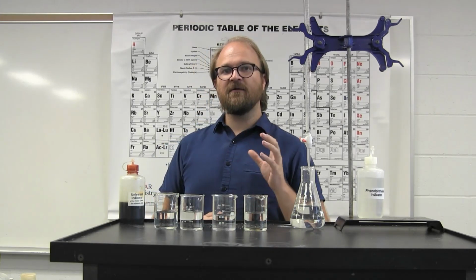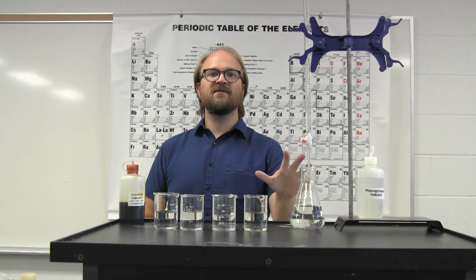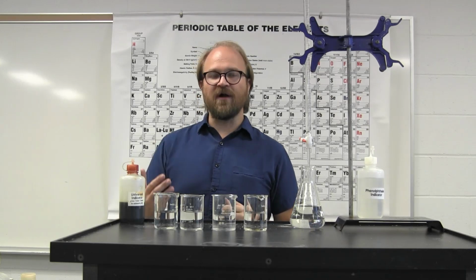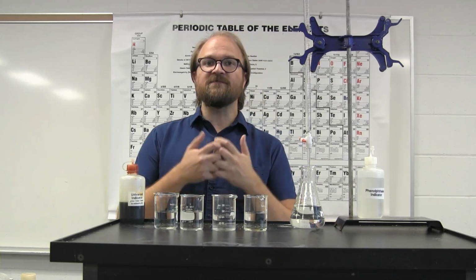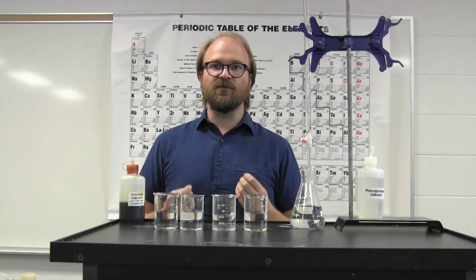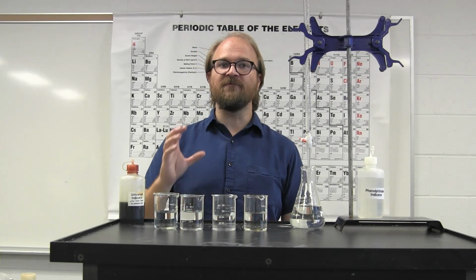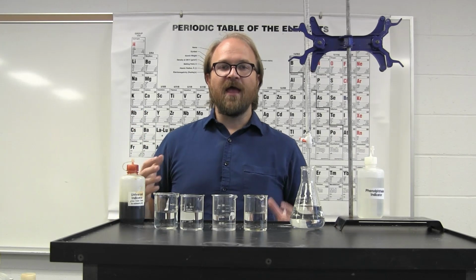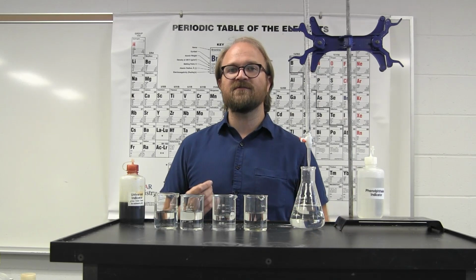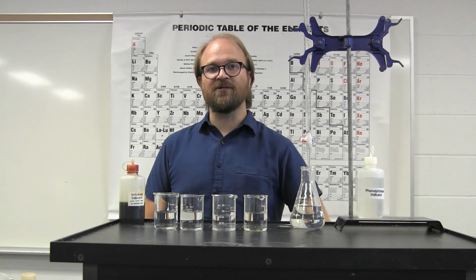The most fundamental acid-base reaction is that of H+, the acid ion, and hydroxide, OH-. This is the basis for almost all acid-base reactions, looking at the pure acid of H+ reacting with the base of OH- to form an equilibrium with water. And this experiment begins to look at that reaction in the form of a titration.